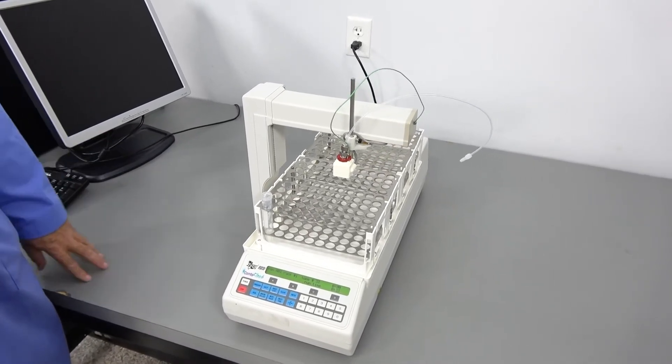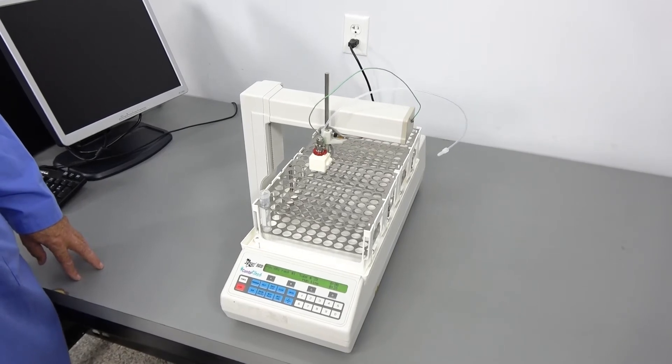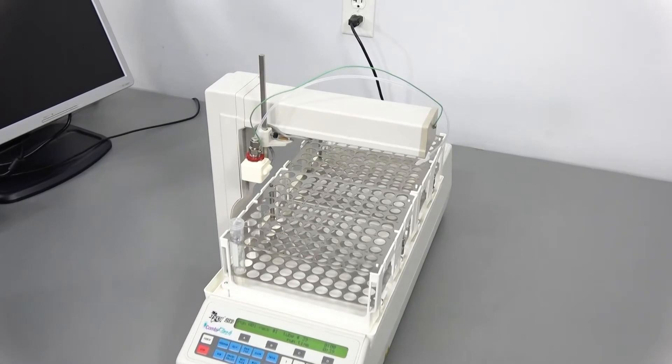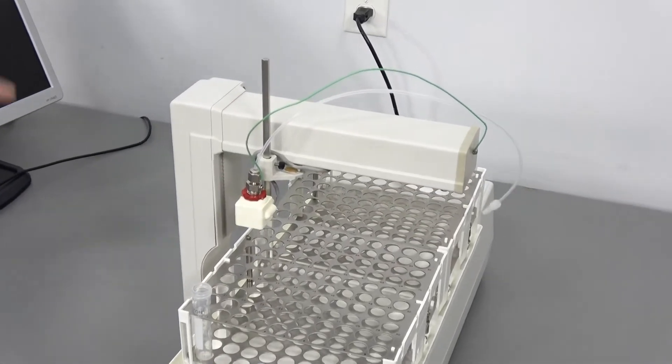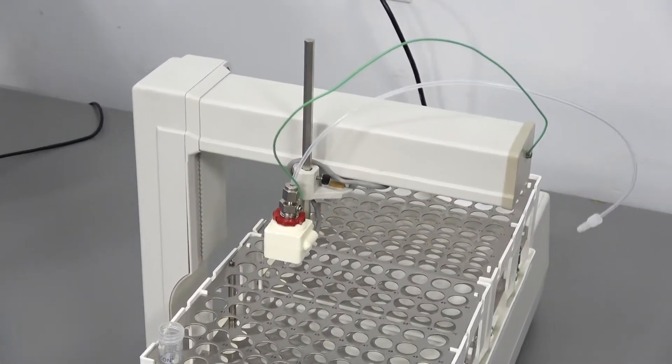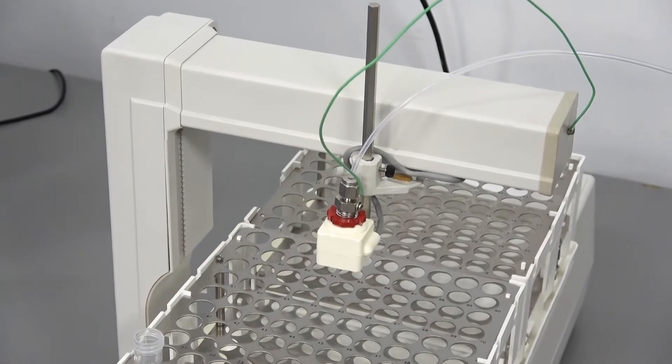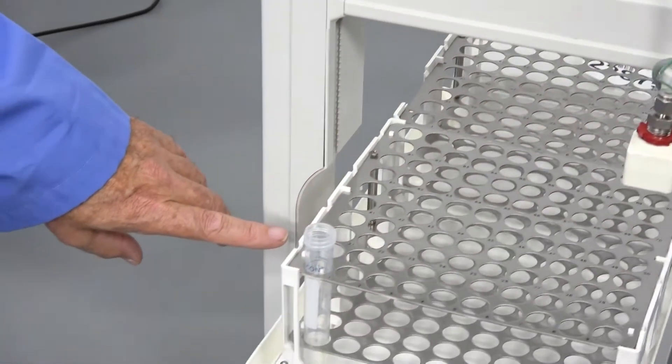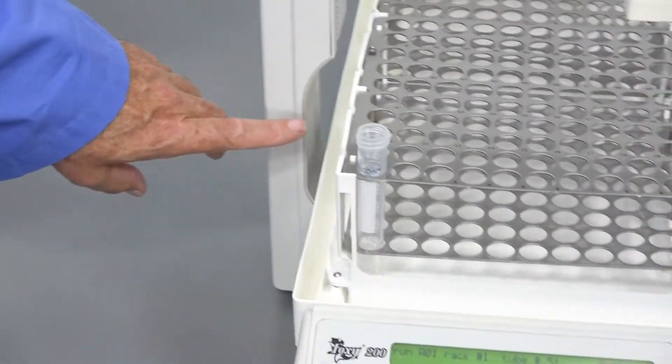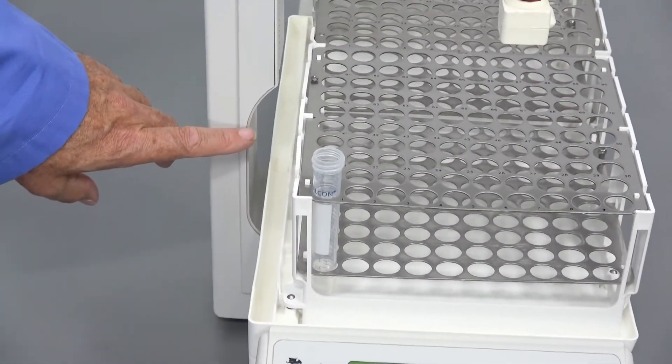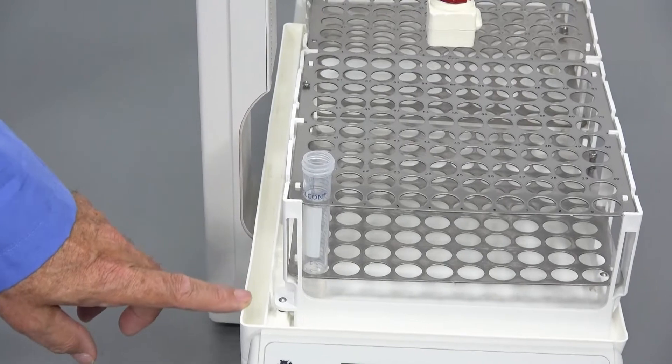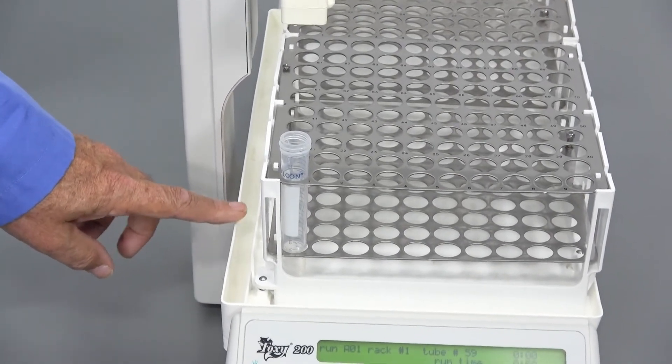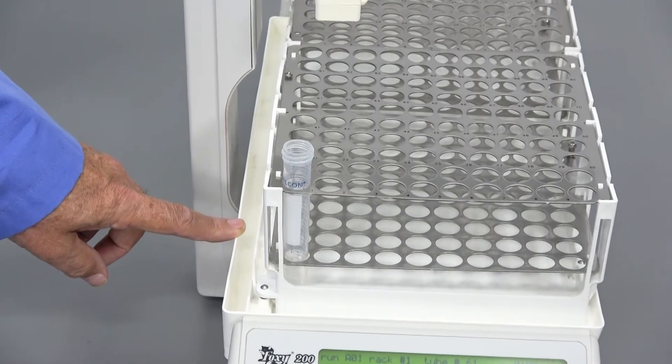As you see, it moves rather well and it does the S configuration to save time and avoid spillage. This particular unit is missing a funnel collection system that would normally attach right here. The main trough does act as that same type of system.